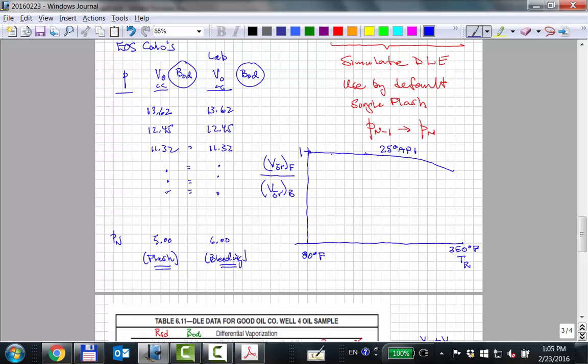If you take North Sea type oils that are like 30 to 45 API, then you're going to start seeing things like this. So that might be a 35 degree API. Now you have to get the lower scale down here. This is not 0.99 down here. This is probably 0.5.